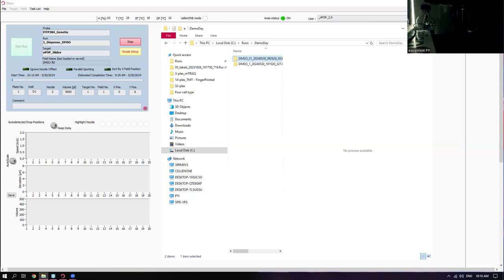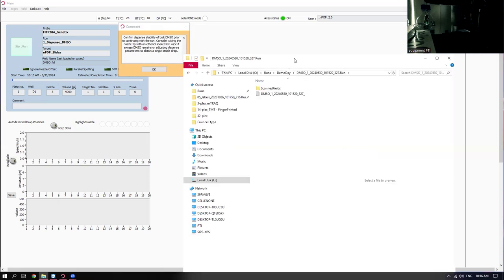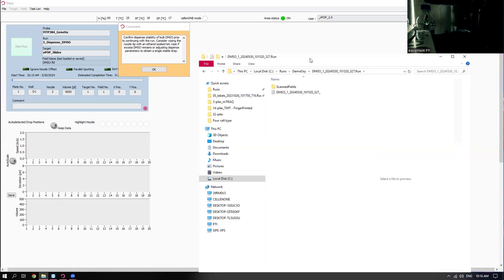There's not a whole lot that breaks down on this machine. As long as you keep the system liquid nice and clean, then you don't end up with clogs. I think it's super satisfying. Probably the most satisfying part of my job is jumping on that call, fixing that problem, and then they continue with the experiment the next day. You know, there's an email, thank you, everything went well.